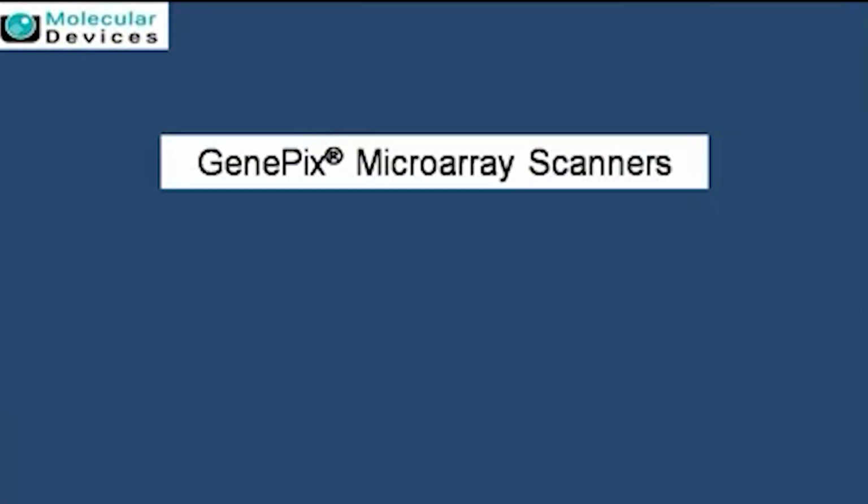At Spinco Biotech, we have been distributors for Molecular Devices for the last many years, and we have been dealing with the scanners at the level of microarrays for many years. As you have already described, this is used in the form of microarrays, and we deal from image acquisition to the level of data analysis for microarray applications. So let's go through a little bit of what GenePix can actually do.